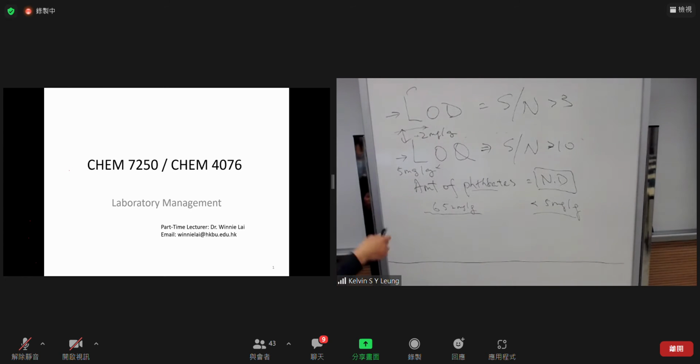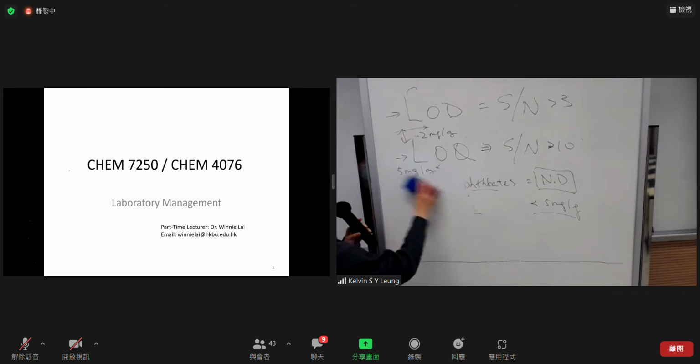So it gives you some idea why they have this kind of reporting style, giving values for you in the report, and why we have to include LOD and LOQ in our method validation. These two values we also talked about last week.